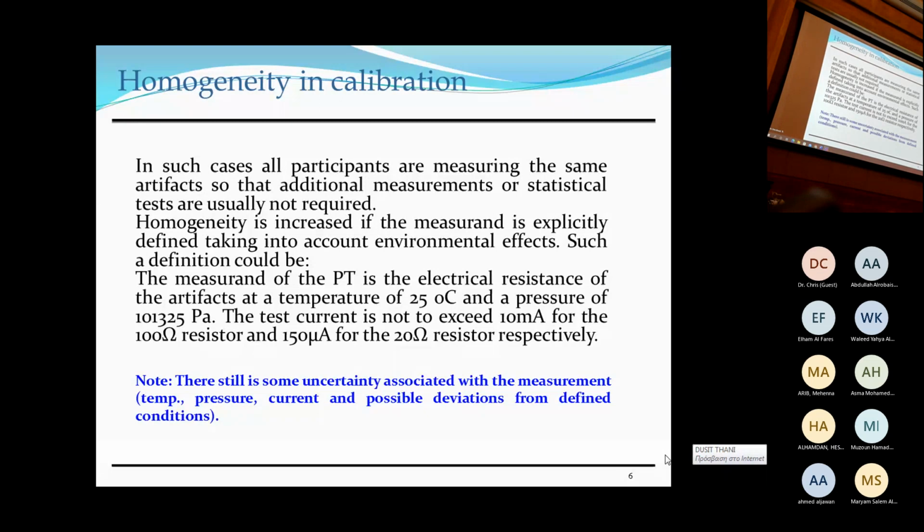So what about homogeneity? As I said, it's very important when we're talking about materials which are being used as samples, and this is true for construction materials, for foodstuffs, for anywhere where you have samples and they're being tested.